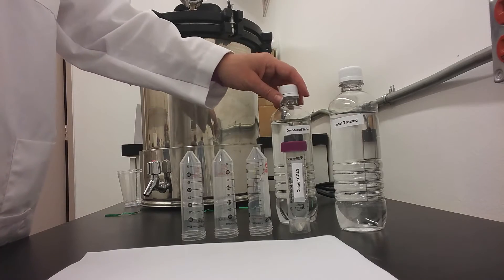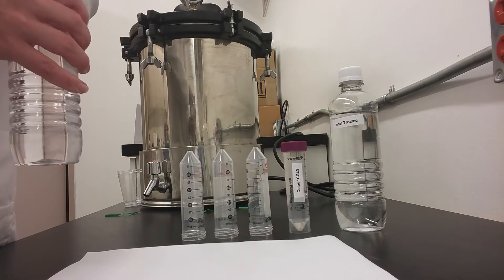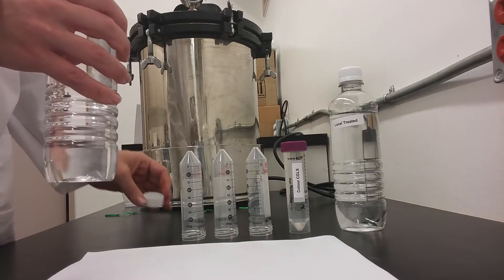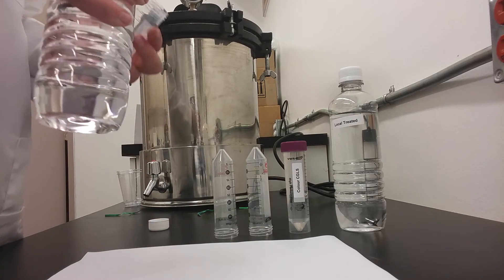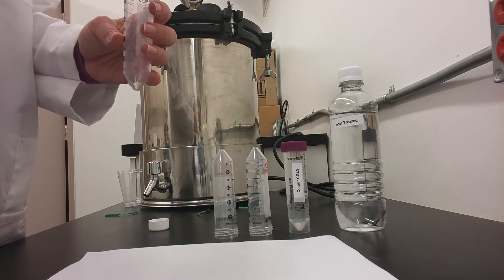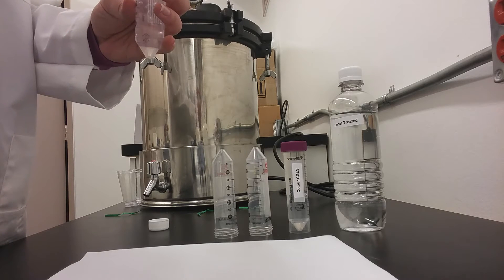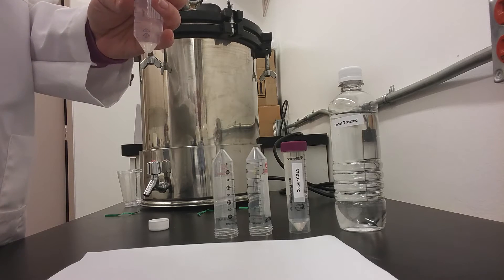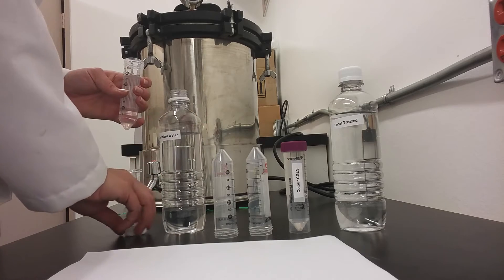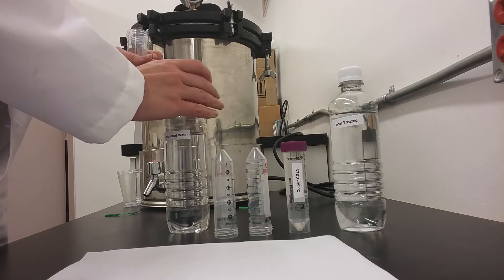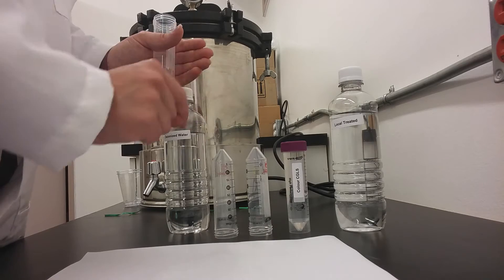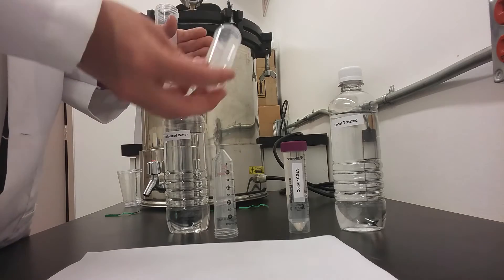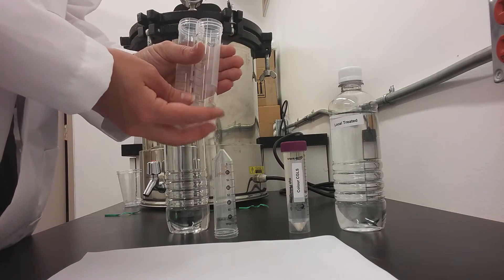To begin with, you will pour an equal amount of each kind of water into the tubes. The source sample that you are choosing to test should be in the middle of the other two tubes.